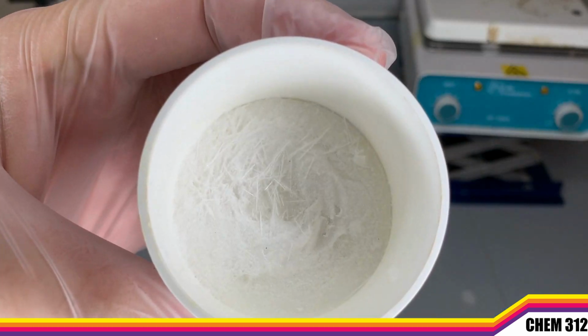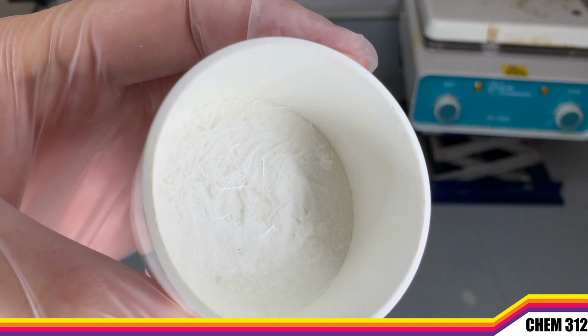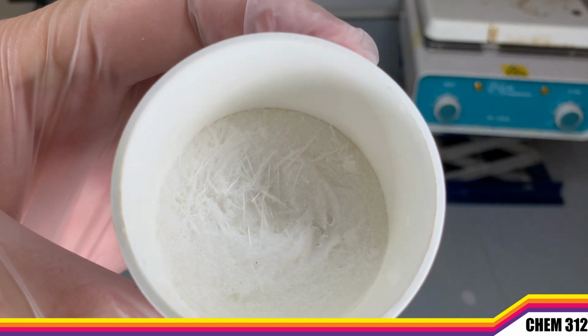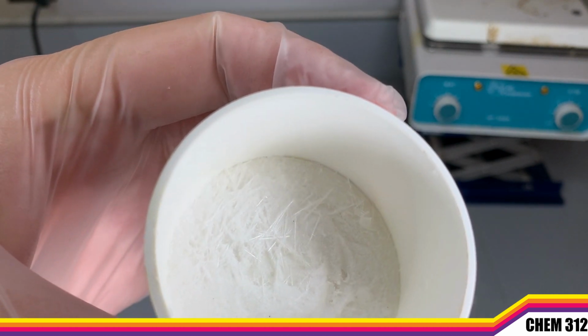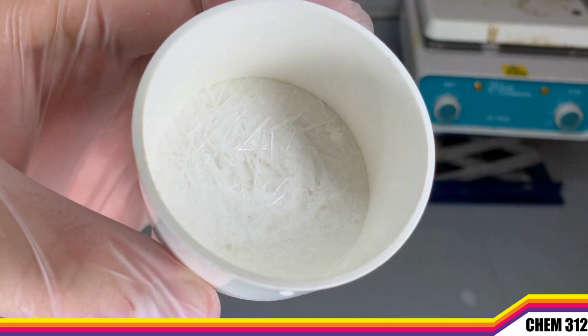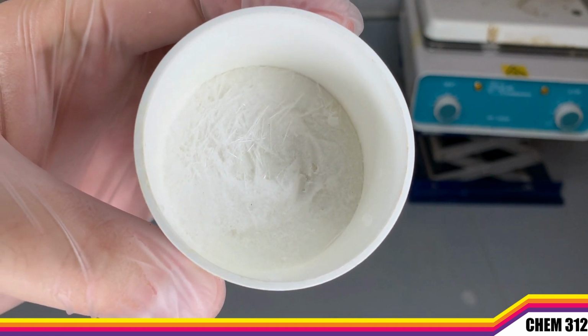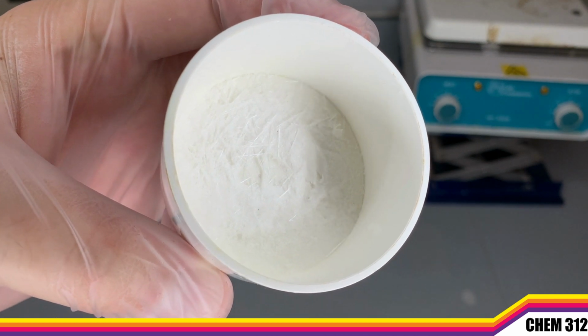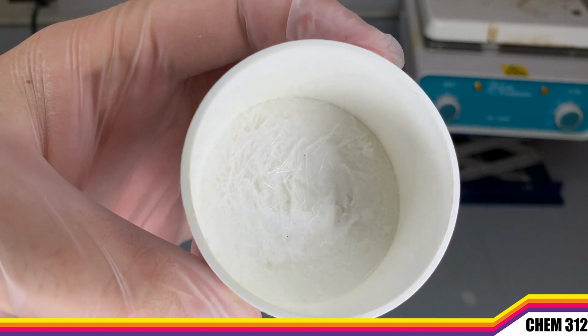So here we have our recrystallized product that's been filtered out of that solution, right? We can see some of those nice long spindly crystals. This almost looks like kind of a bird's nest of these crystals that were filtered out. So let's get a mass on this and we'll see how much we were able to recover, and we'll see if our recrystallization actually purified this mixture of salicylic acid and caffeine.